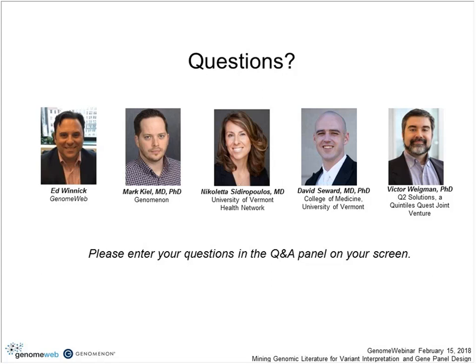So the short answer there is batch VCF processing is probably the easiest way to get that information, if not through API data feeds.